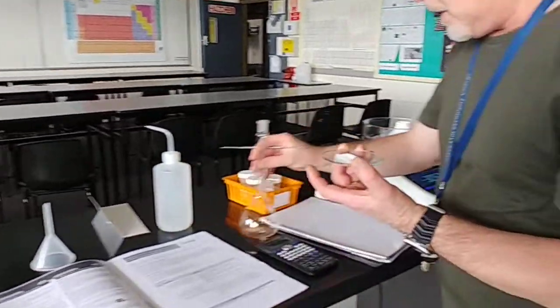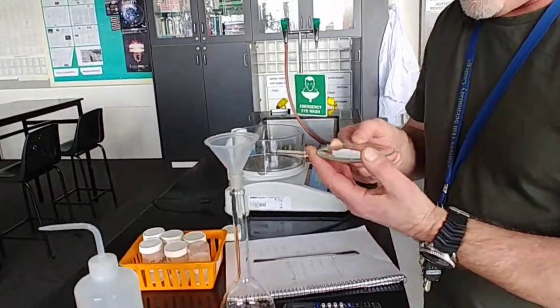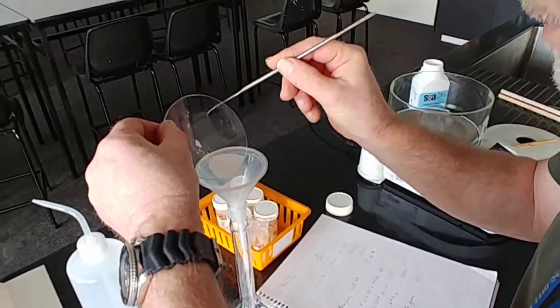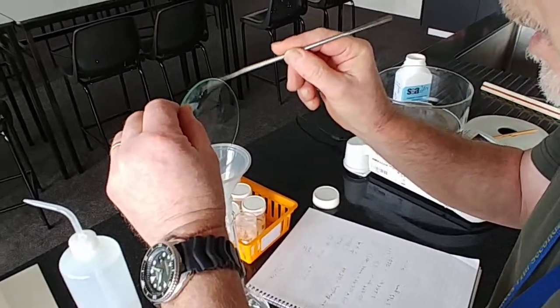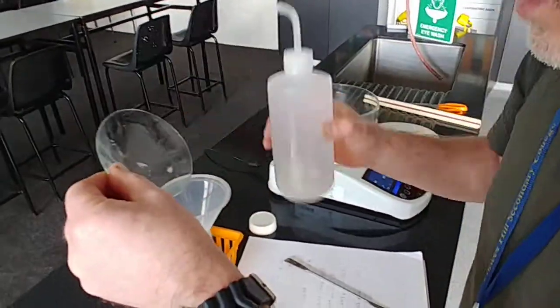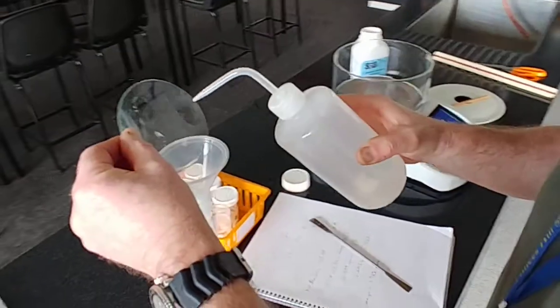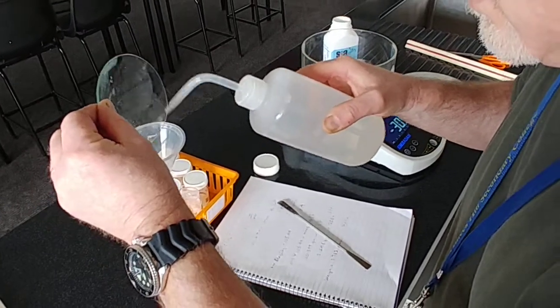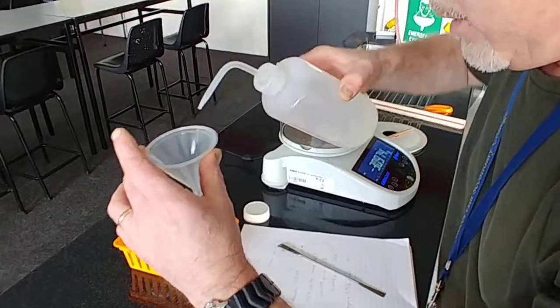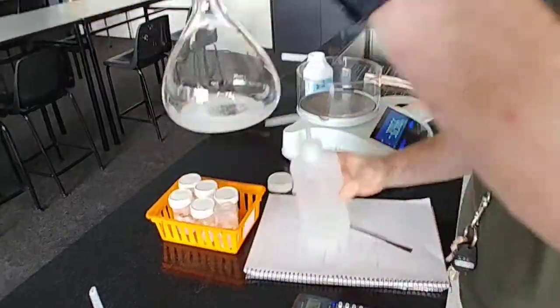and now we need to transport this into our volumetric flask here. And the way we do that is put the funnel on there, just tap it gently. Now, because this is so accurate, we've got residual stuff on our watch glass. Okay, we need to wash all that down. So all that's gone down, all right, nice and clean. Then we need to wash that down. Okay, then we need to wash that down. So now all of our chemical is contained in there.